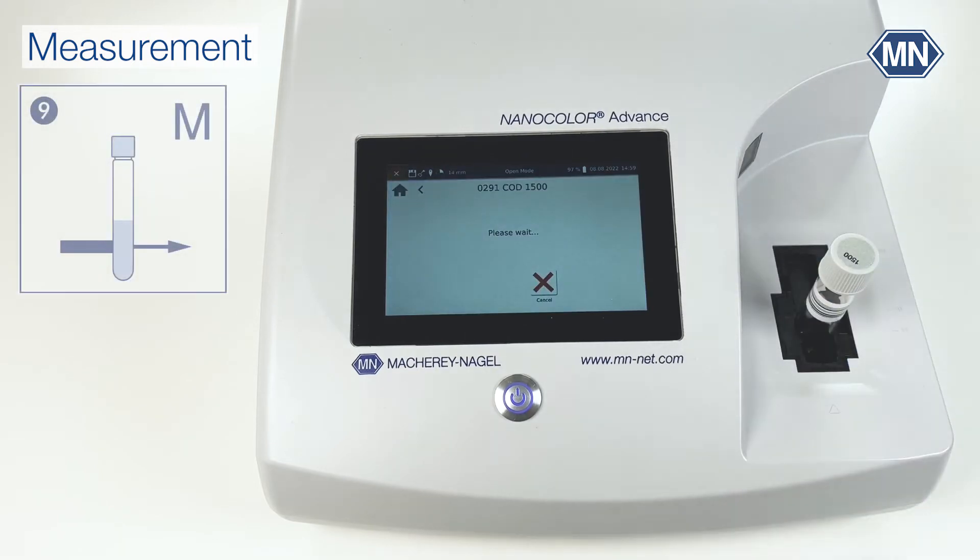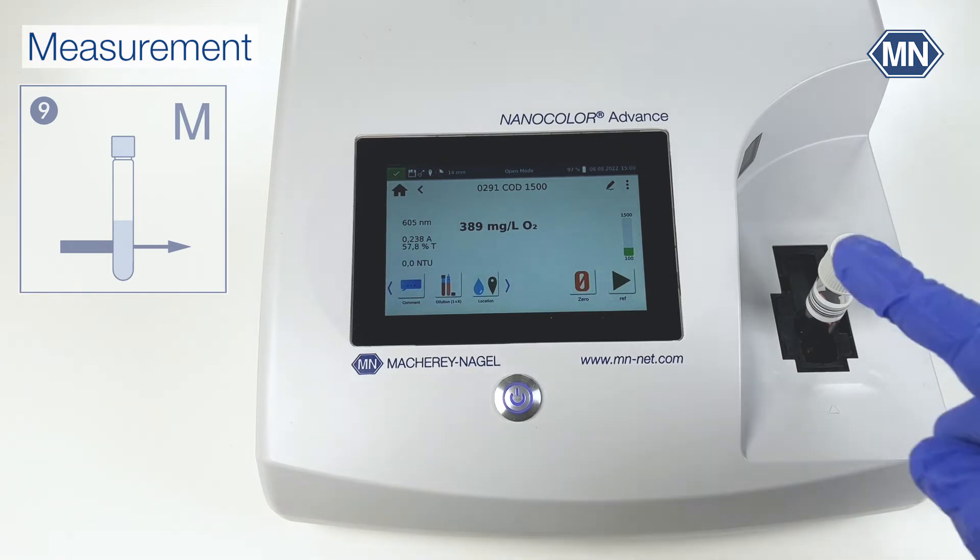Insert the test tube into the cuvette slot. The Nanocolor Advance recognizes the test number automatically and determines the result, which is shown on the display.